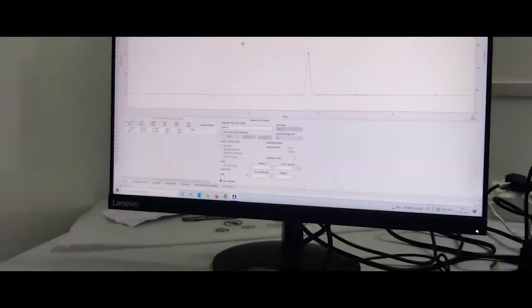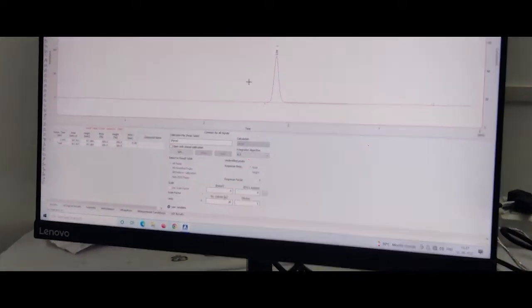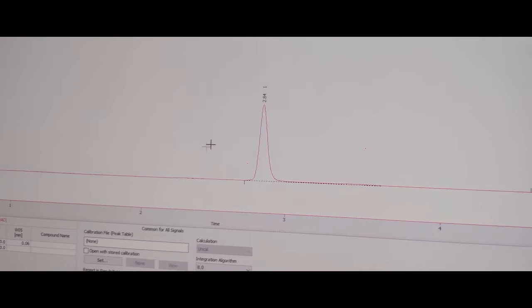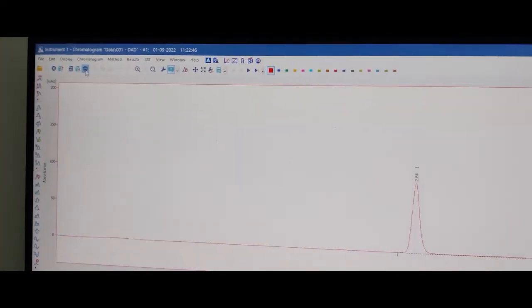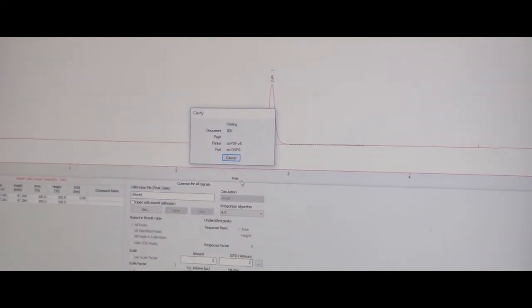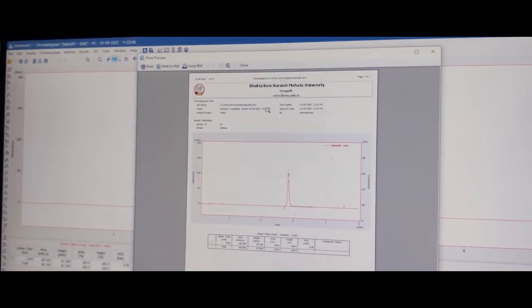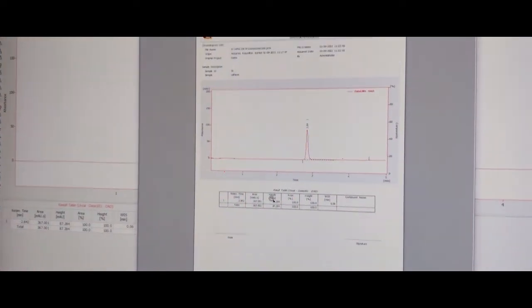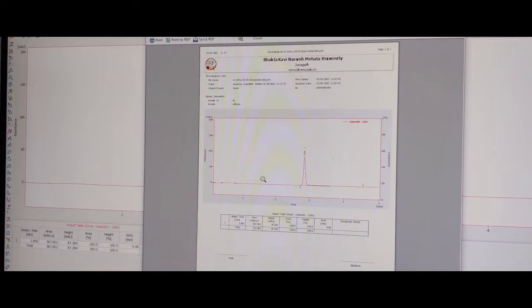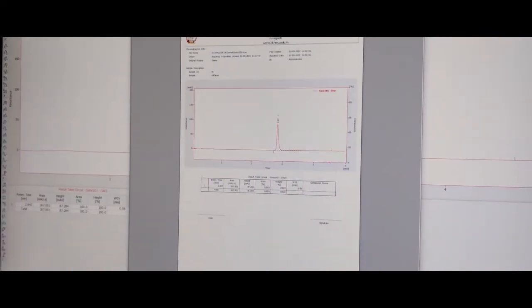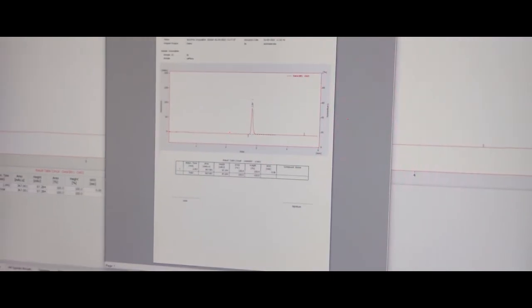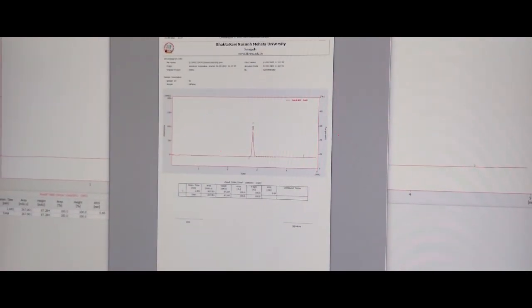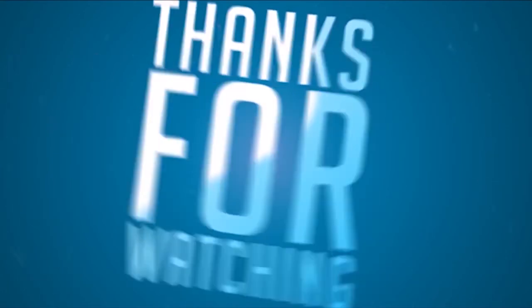After completing the sample run, you can see the result. Go to print review. You see the result. If you want to print, please take the printout.